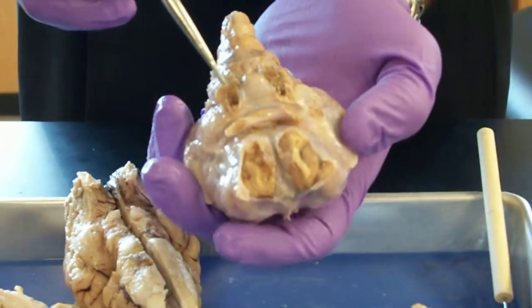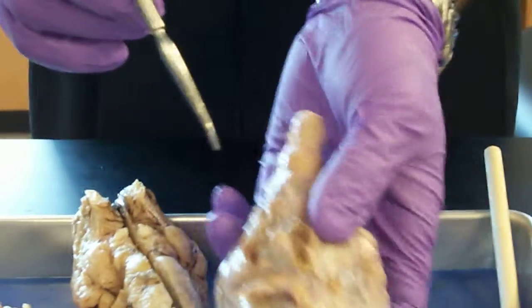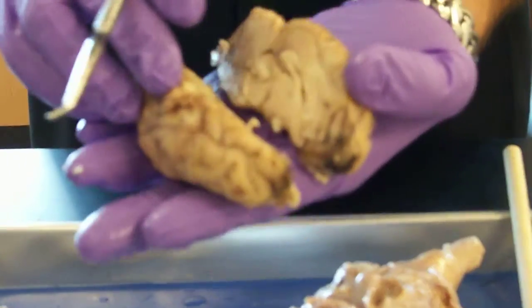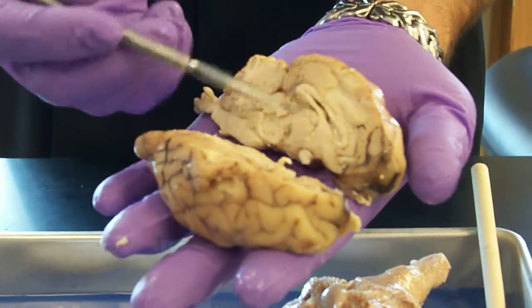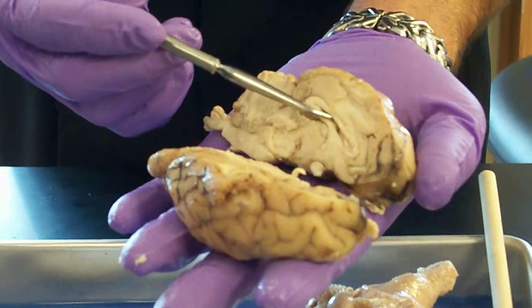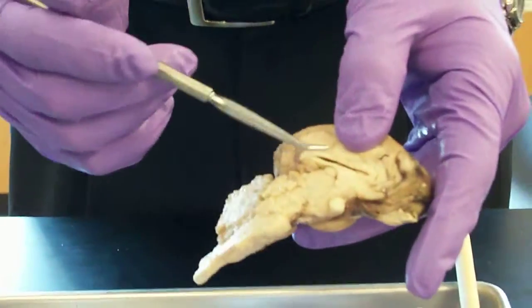And where are the different ventricles on it? Okay, so if I open up this brain, we can see the base of the cerebrum. If you look at the base of the cerebrum, it's attached to this structure called the corpus callosum. We can actually open up that corpus callosum, and you can see there's a space in there.